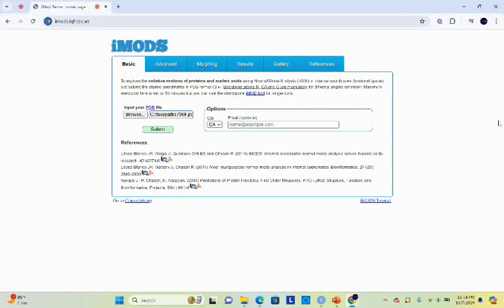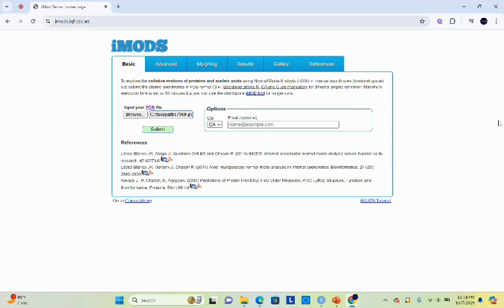Welcome back to the bioinformatics hub. In this video we will learn how we can perform molecular dynamic simulations using iModes. If you are curious about how proteins behave in a dynamic environment and how to analyze these results, you are in the right place.